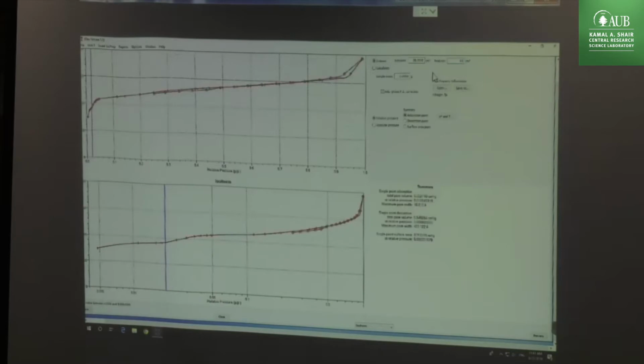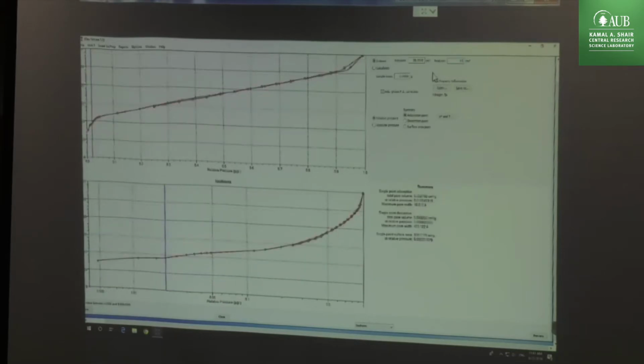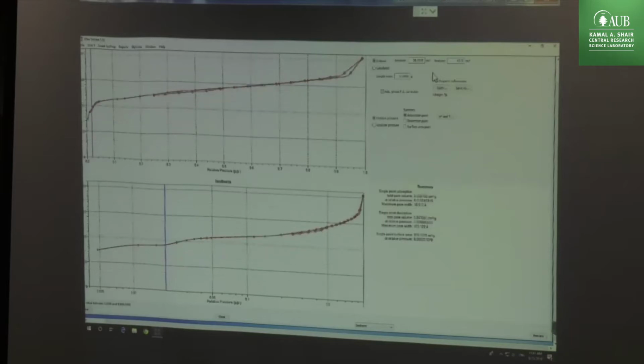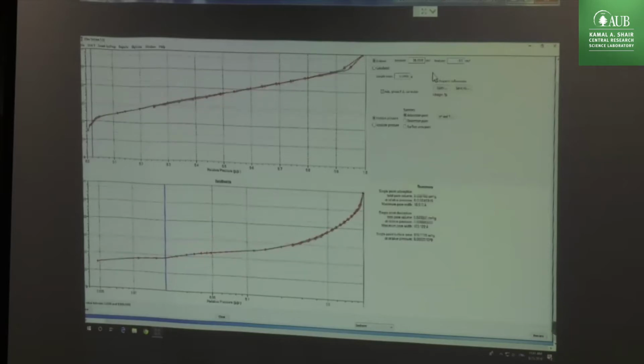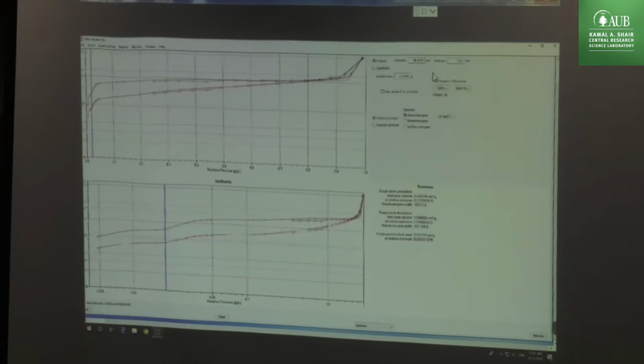Okay, wait, 63.9. Okay, no. Okay, this is the best fitting.